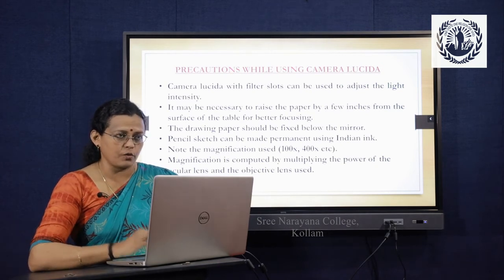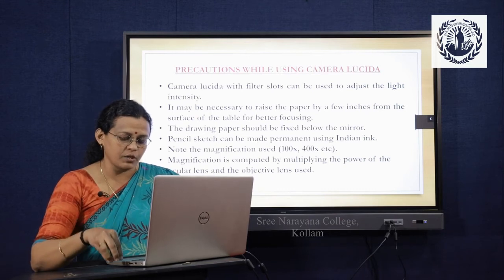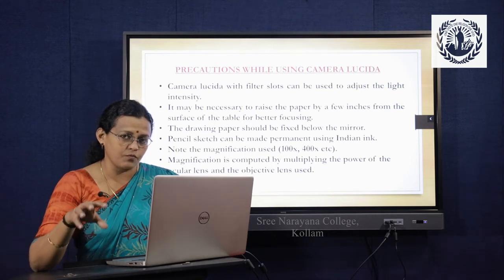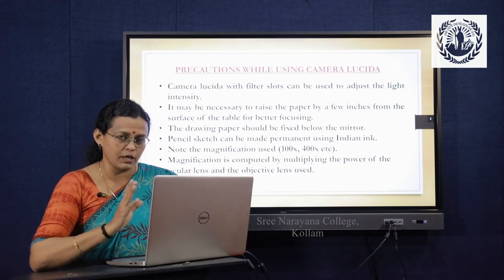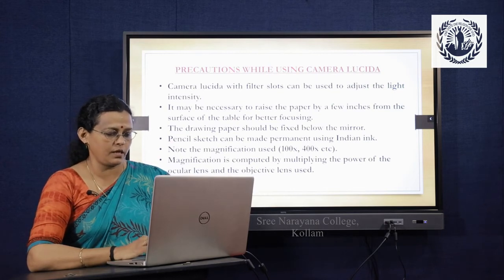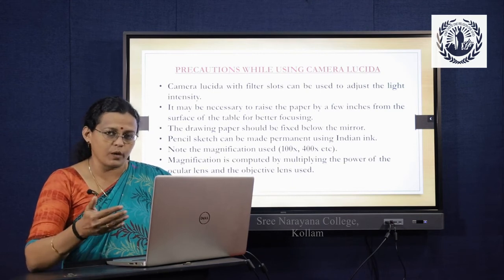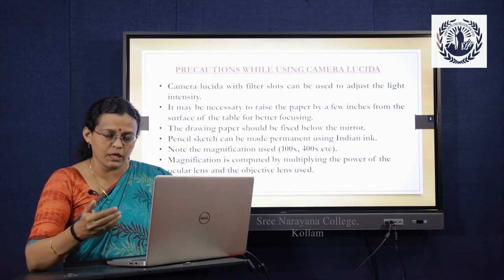Then note the magnification. While giving the note to this particular diagram, you should know the magnification you used while drawing this picture. Under 100x, it gives only 100 times magnification of the image, whereas under 400x, it gives 400 times magnification. So you should know what magnification you have used. Magnification is computed by multiplying the power of the ocular lens and the objective lens used. Now I shall show you the working, how you mount the Camera Lucida onto the compound microscope and how you do the drawing.